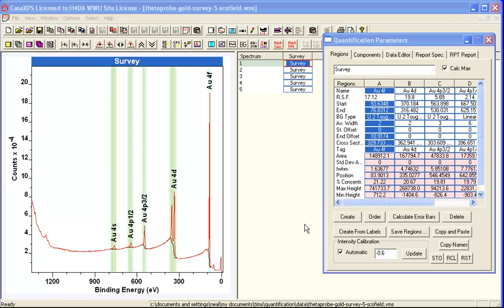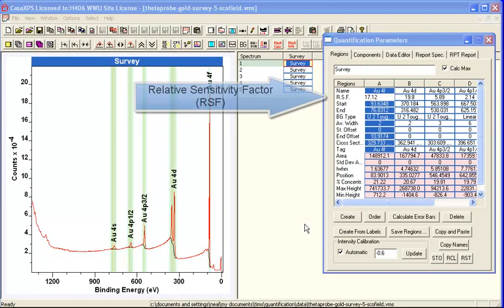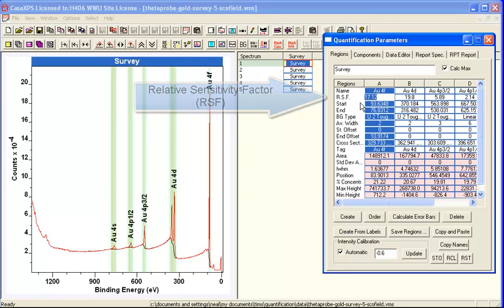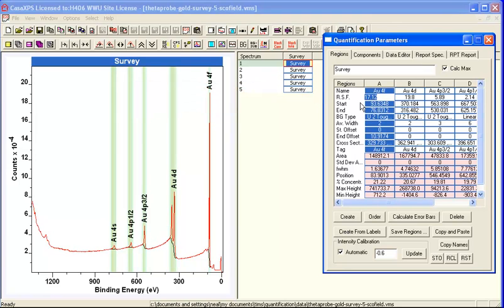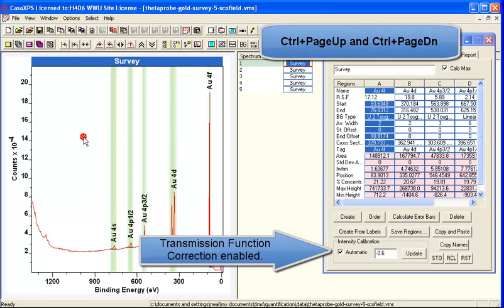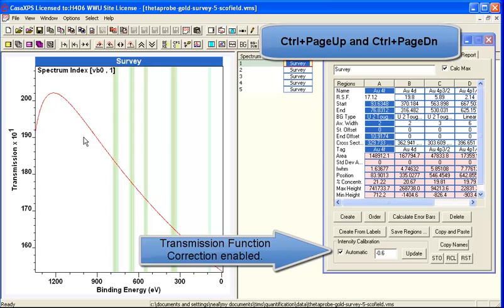Quantification of theta probe data is often performed using Schofield cross sections to adjust peak intensities for the fundamental process of photo emission. In addition, we have a correction based on the transmission of the instrument which varies as a function of the kinetic energy.